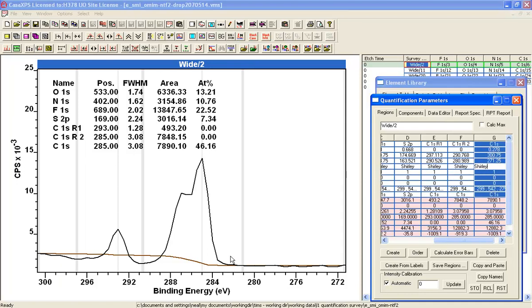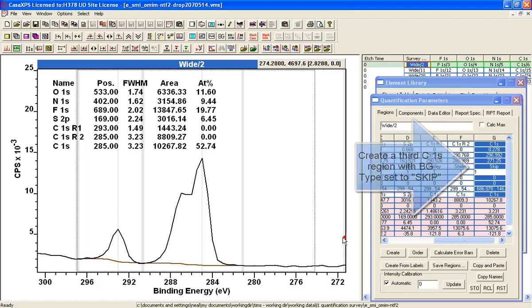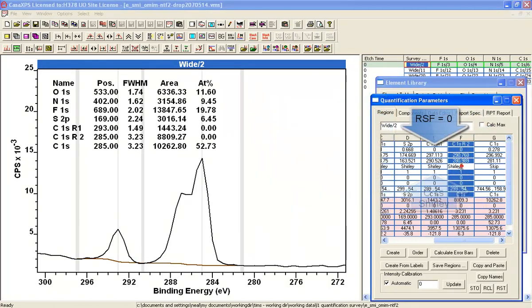Instead of having Shirley, where it's now calculated a background that is cutting through the data again. If I change that to skip, what it allows me to do is to use the background that has already been calculated. So these two, although the RSFs are set to zero, the background is a Shirley in one and a Shirley in the other. Two regions independently creating backgrounds, but with no contribution. As you can see, zero and zero for the concentration. But the one peak that I've got a skip background is using the existing background that you see here. And integrating the signal above that background and reporting the result here.